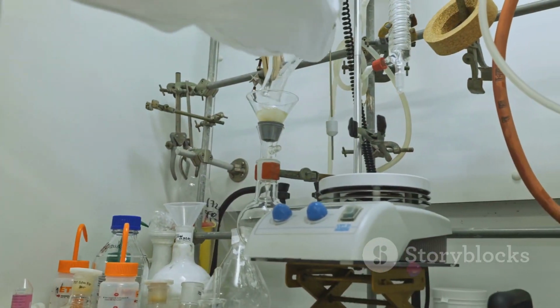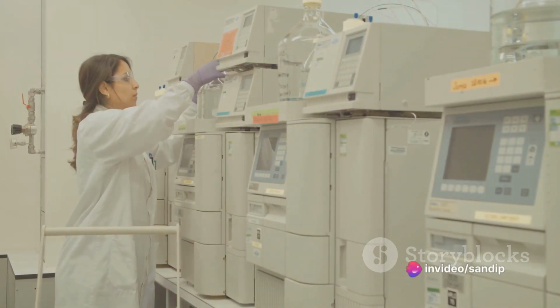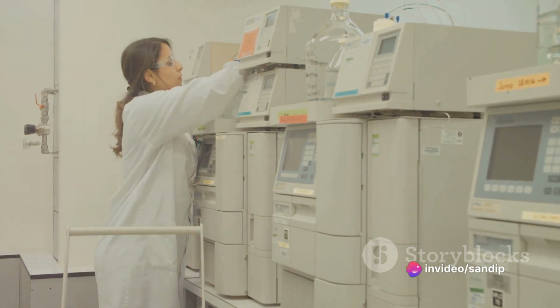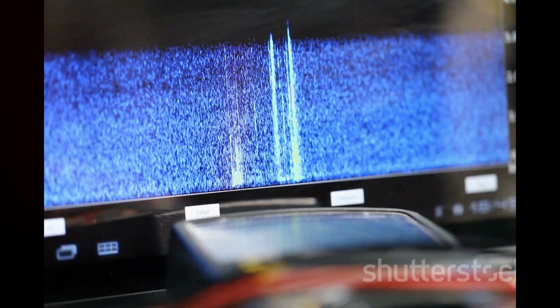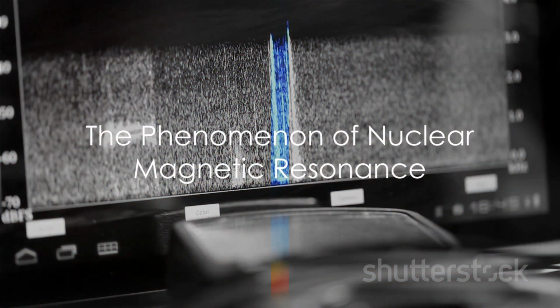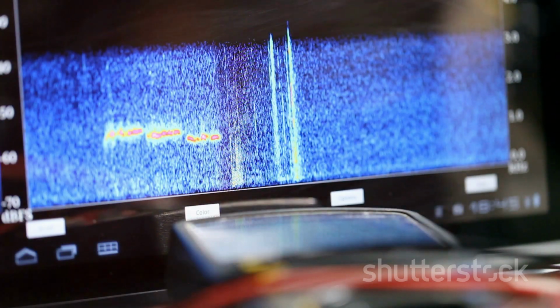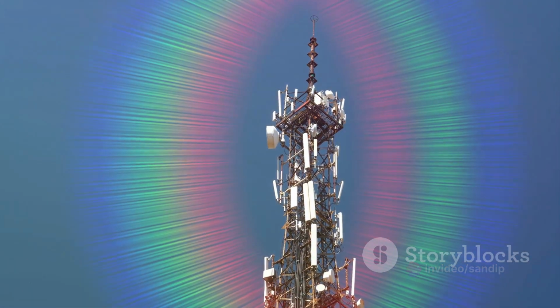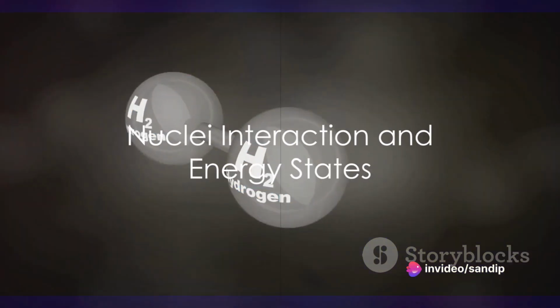It's a key player in the field of analytical chemistry, and its applications span far and wide, from the study of biomolecules to the analysis of complex mixtures. The heart of NMR spectroscopy lies in the phenomenon of nuclear magnetic resonance. This happens when atomic nuclei in a magnetic field absorb and re-emit electromagnetic radiation. This radiation often falls within the radio frequency range, and by measuring this, scientists can gain invaluable insights into the structure of the molecule. But how does this work exactly?